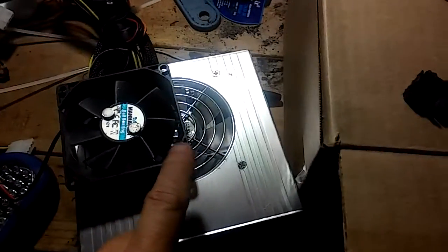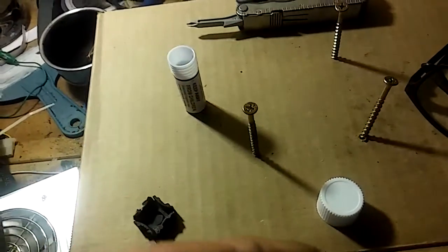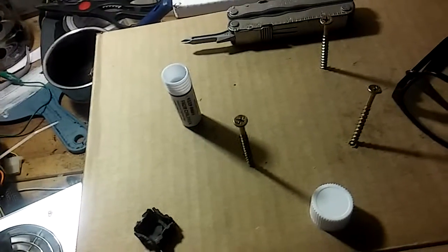I'm going to mount this fan through these holes in the cardboard with these screws and give it a good test. When the cardboard starts to get a little too supple I'll change it out and build an actual box. The power supply switch is going to be right here and I'll stuff the rest of the cords inside.